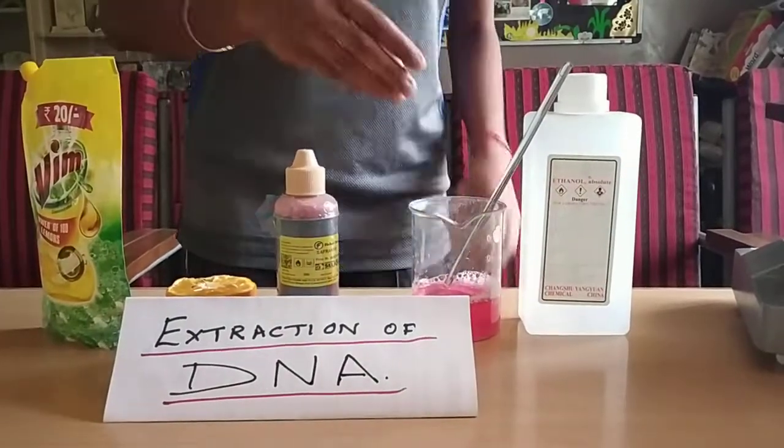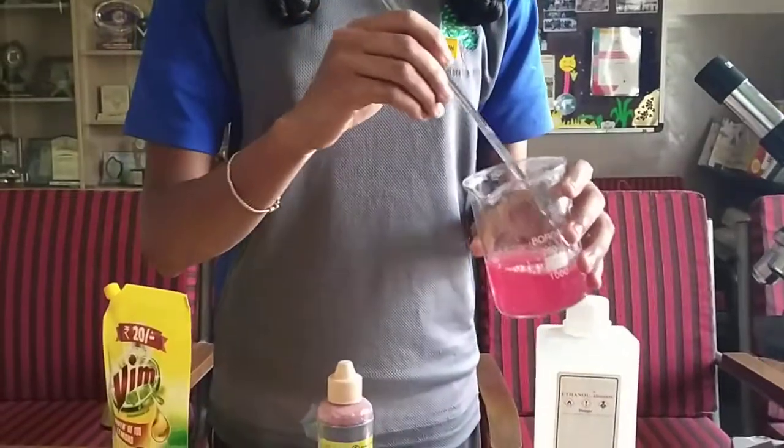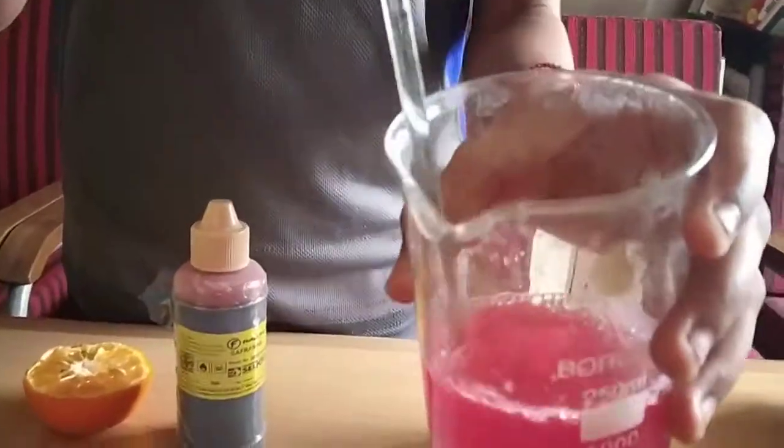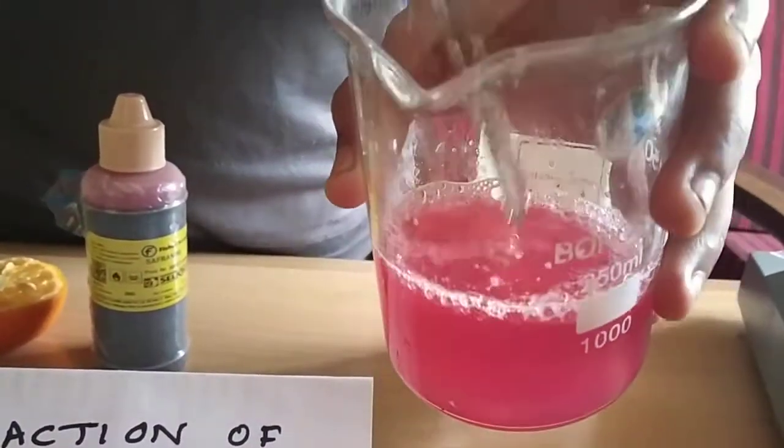Then you can see that the white particles standing on top are the DNA. We can see that the extraction of DNA is visible here.